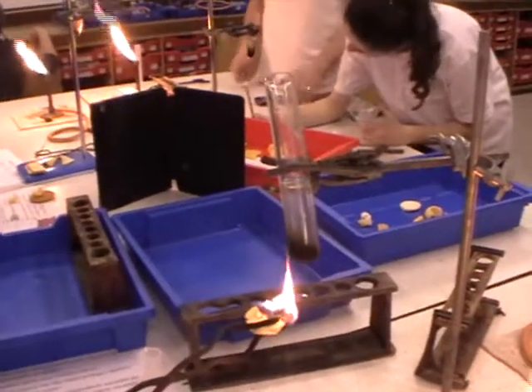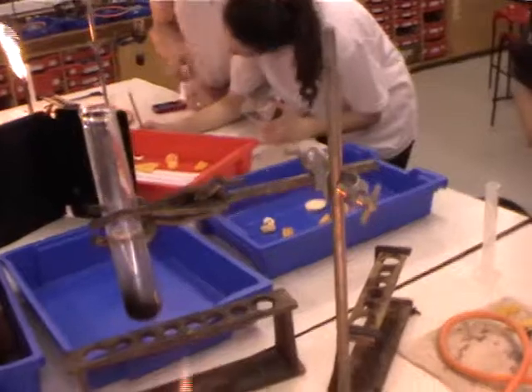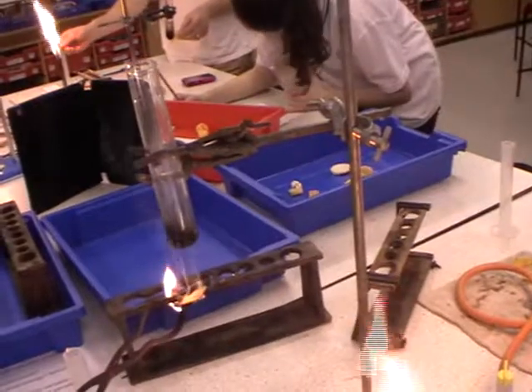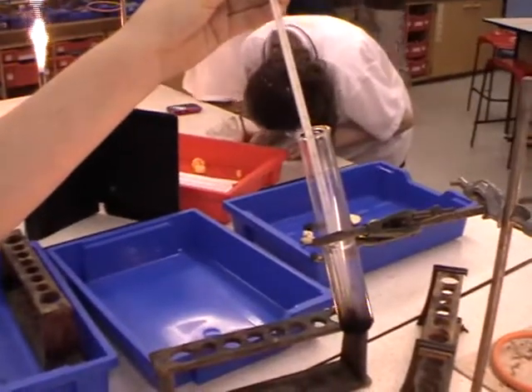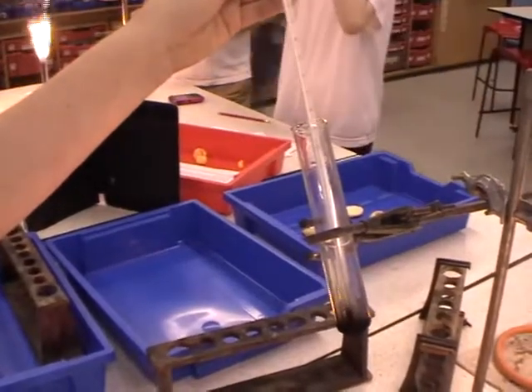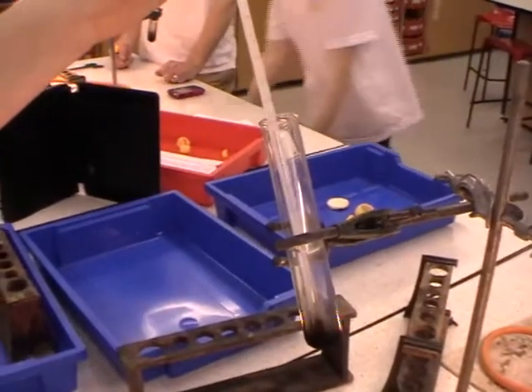It started burning, so the product burned out. Hopefully it should not have too much residue. It'll be the water. Stop burning. Next we'll take the temperature of the water now. The temperature now has risen to 26 degrees.